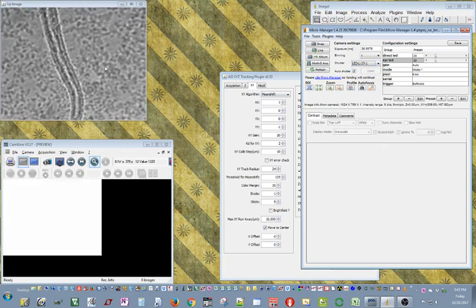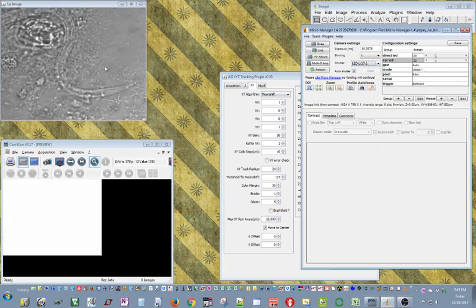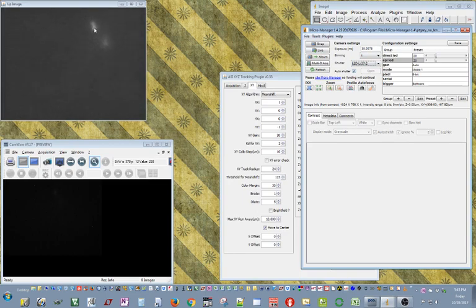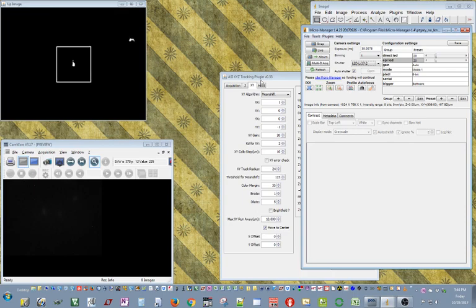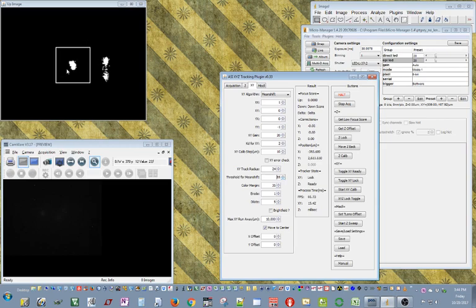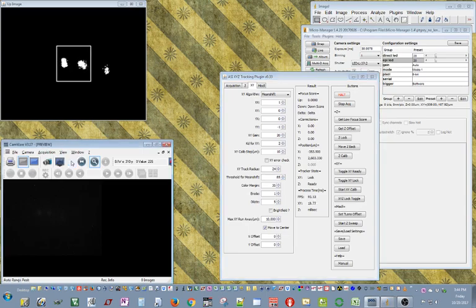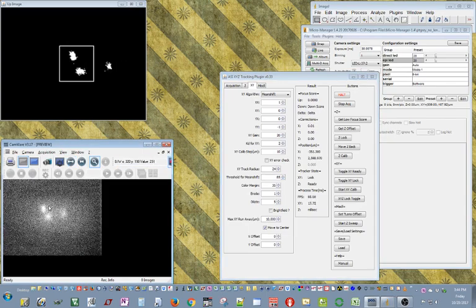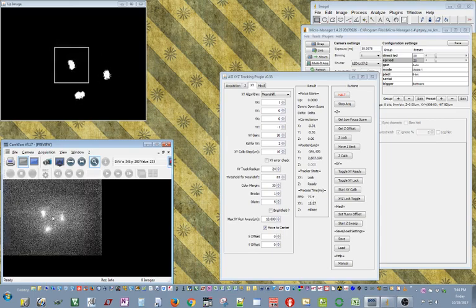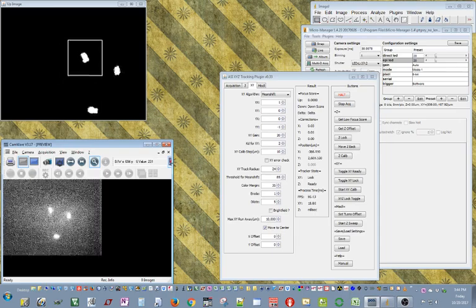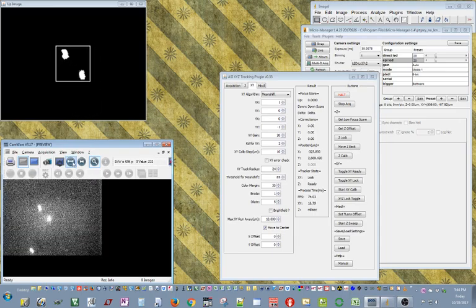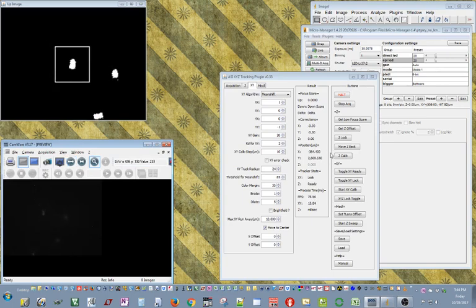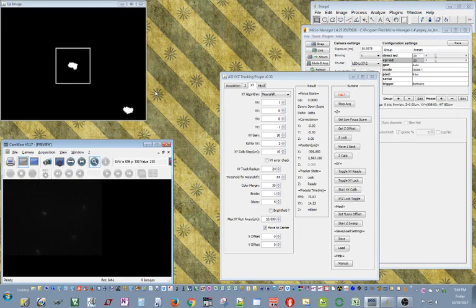Let me start all over again. Try it on another thing. Okay. Let's find somebody. I think we troubled that guy enough. Okay. Ah, found one. Got it. Click on it. Left clicking tags the sample. And right click locks on it. I think the threshold is too high so I'm going to reduce it. Okay. Now we have a stronger blob. It's tracking on. I'm going to adjust the exposure on this camera to see what exactly is happening here. Okay. We've got three of them there. Maybe slightly in a different Z plane. So I'm going to fix that. Let's see what's up with that. Yeah. It's running. It's not as fast. This one is not as fast. Yeah. So we are tracking. Okay. So that's mean shift.